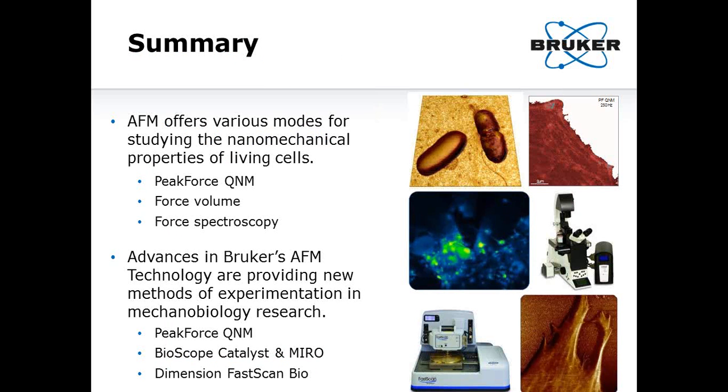So in summary, as demonstrated in this presentation, AFM offers various modes and techniques for studying the nanomechanical properties of living cells. PeakForce QNM allows nanomechanical property mapping at high spatial and temporal resolutions, while the additional range of loading rates available with force volume can provide important information on time-dependent or viscoelastic properties.